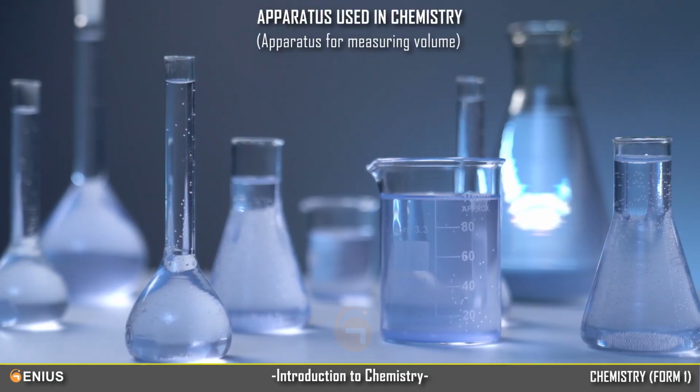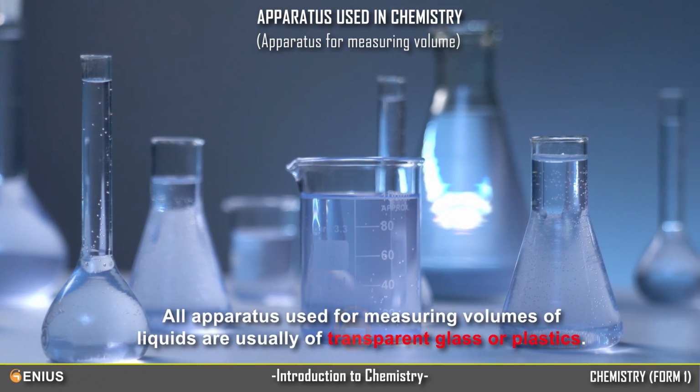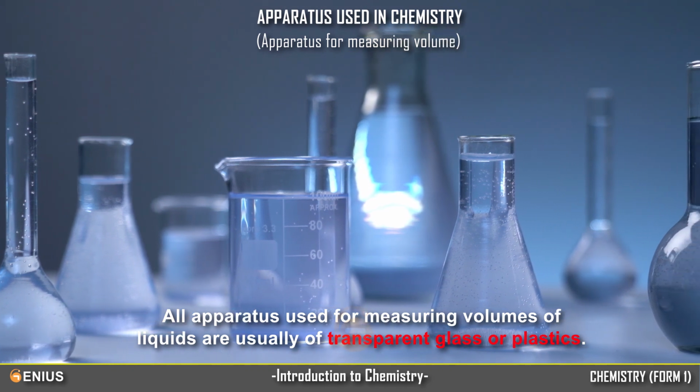Apparatus for measuring volume. All apparatus used for measuring volumes of liquids are usually of transparent glass or plastic.